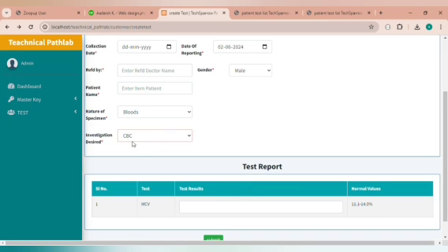Actually I already know that in this section we have to use the units, but I show you that when you use this software, in this section you should focus on that and define the units.